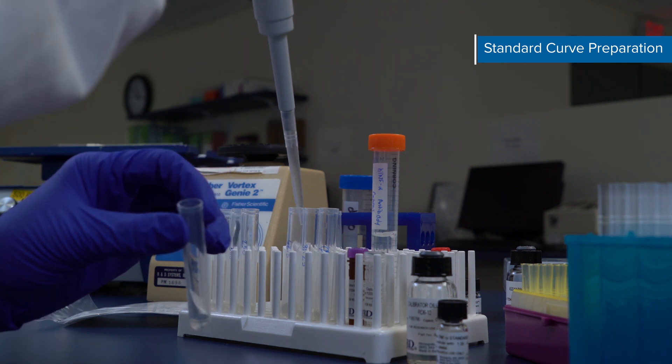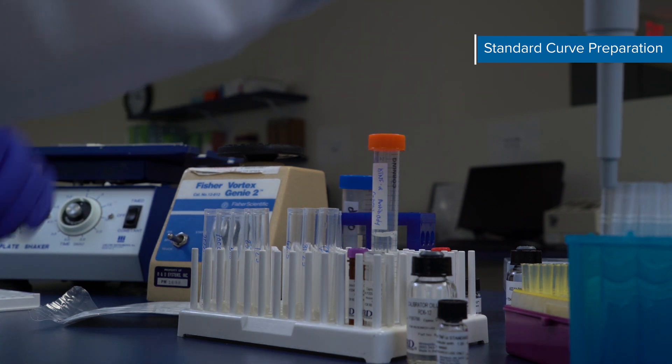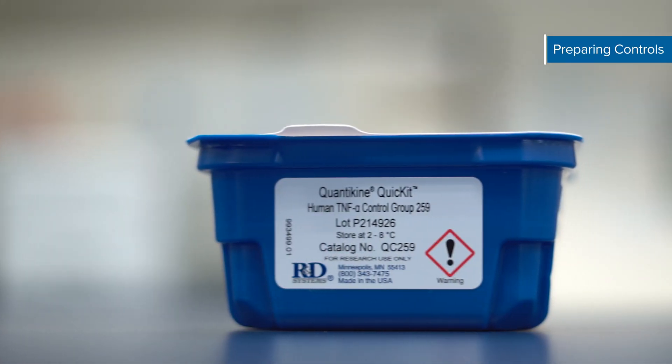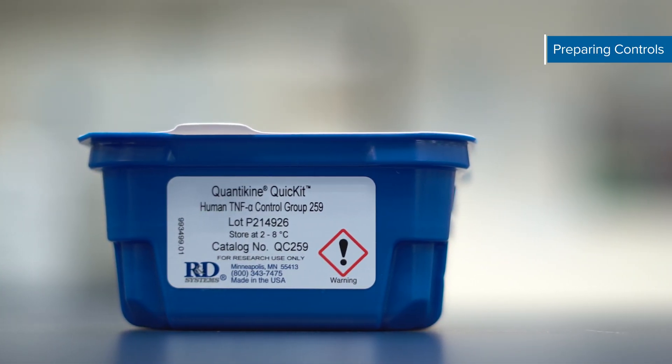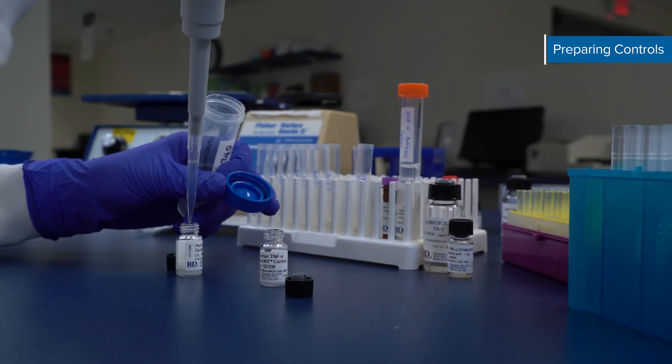The calibrator diluent serves as the blank. Blank wells contain zero standard and are treated identically to assay wells. They serve as the non-specific binding control for all assay reagents. In this assay, we're using the kit-specific R&D Systems QC Controls catalog number QC259. Check your kit booklet for the analyte-specific controls.